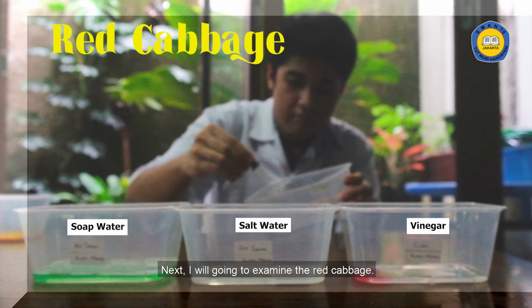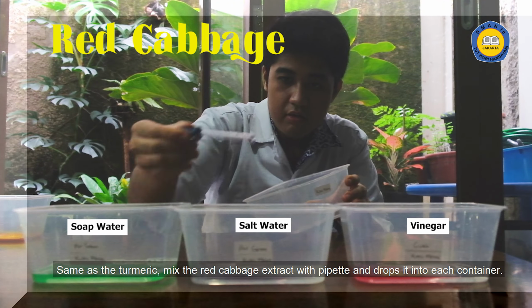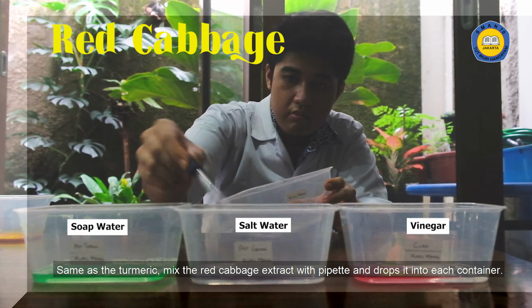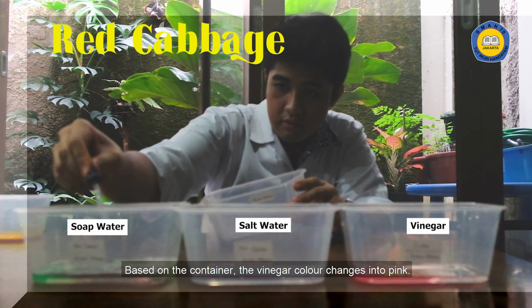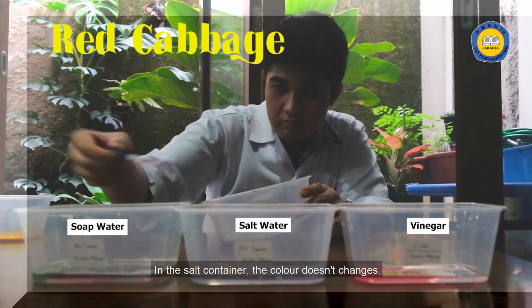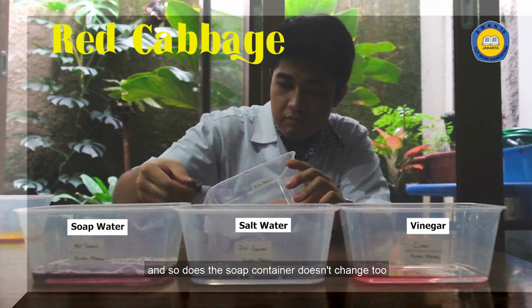Next, I'm going to examine the red cabbage. Same as the turmeric, mix the red cabbage extract with the pipette and drop it into each container. Based on the containers, the vinegar color changed into pink. In the salt container, the color doesn't change, and so does the soap container.